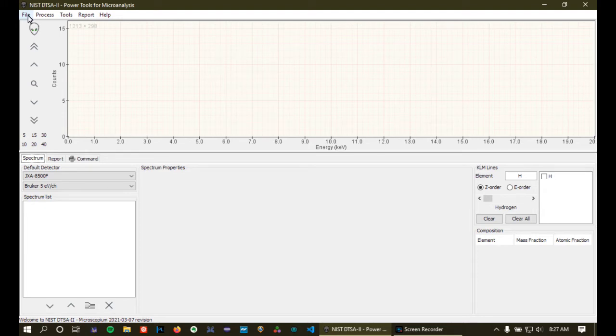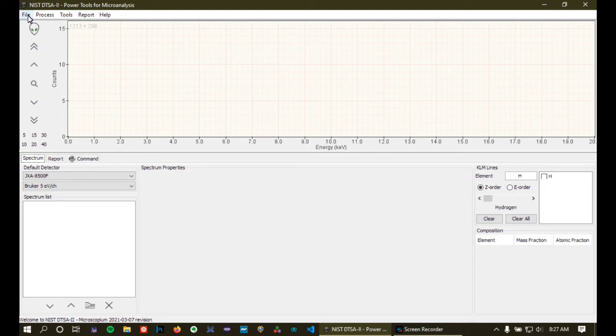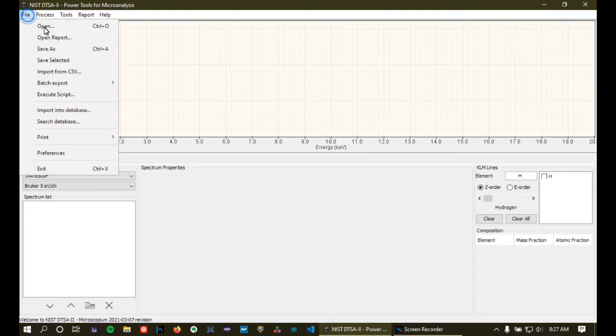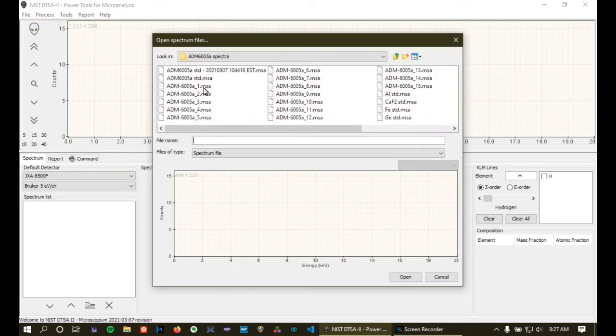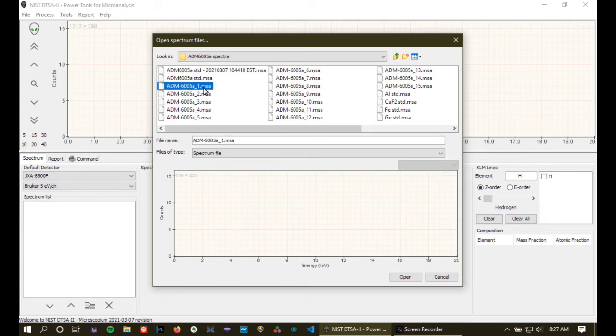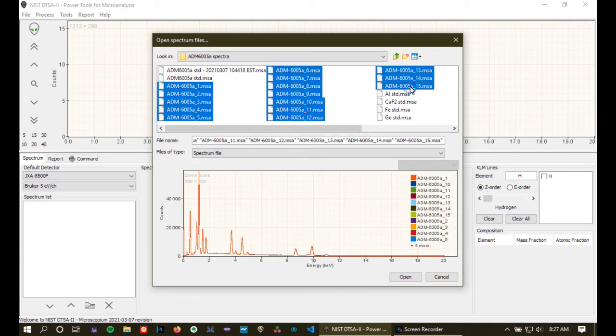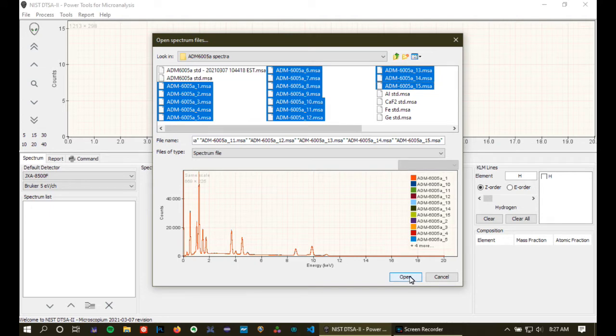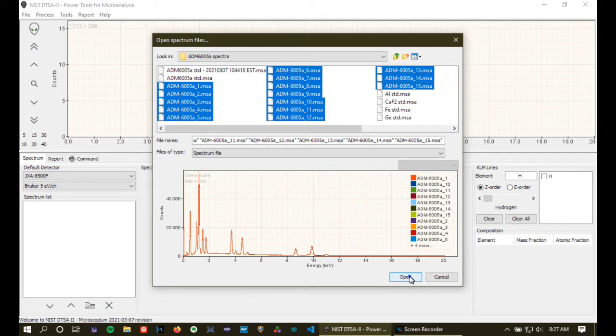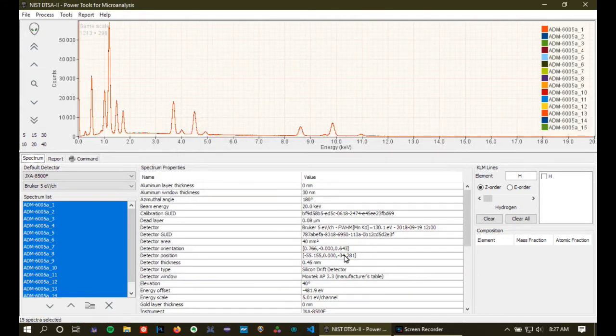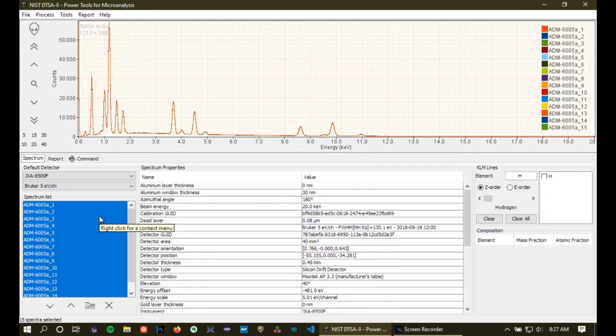So first thing we're going to do is we're going to open a series of spectra that we're going to be using to create our standard. So we're going to be using an ADM glass which is an engineered glass constructed here at NIST by Doug Meyer. So I've opened, in this case, 15 spectra. This is more than I would usually do. Usually I recommend collecting about five spectra. Usually my rule of thumb is I collect five spectra each at 60 seconds.